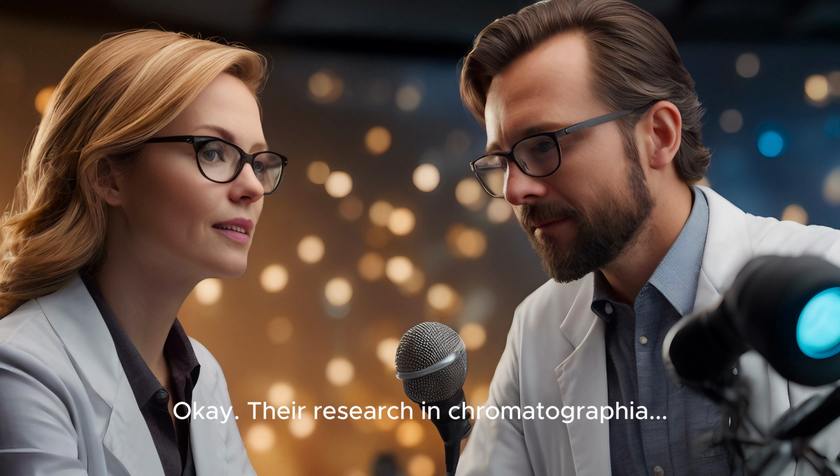Their research in chromatography focused on using a technique called reversed phase high performance liquid chromatography, or RPHPLC. That sounds pretty technical. It is a little bit. Can we break it down a bit?